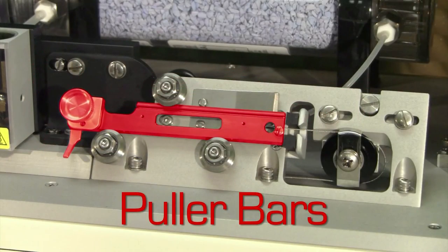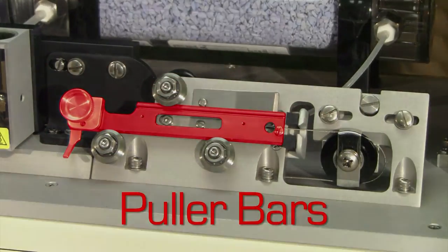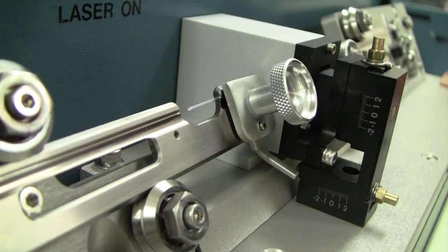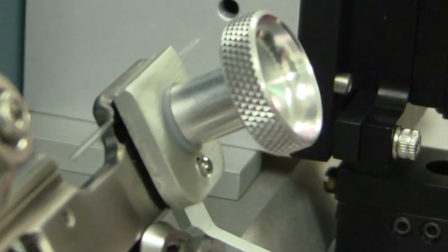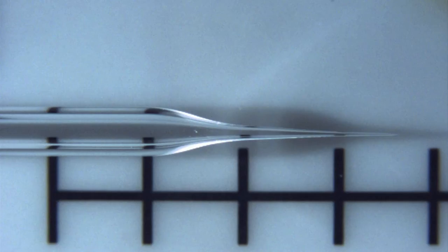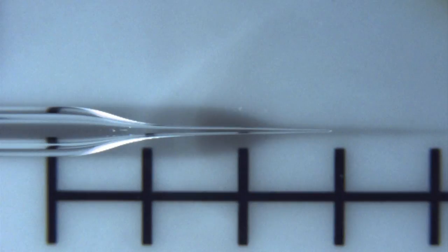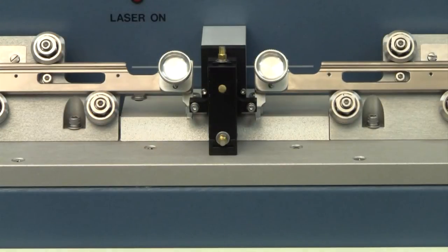The puller bars hold and position the glass capillary before the pull. More importantly, they control the movement of the capillary while the pull is executed. So it is crucial for appropriately shaped and reproducible pipettes that the puller bars are completely straight, parallel and in a well-defined position.